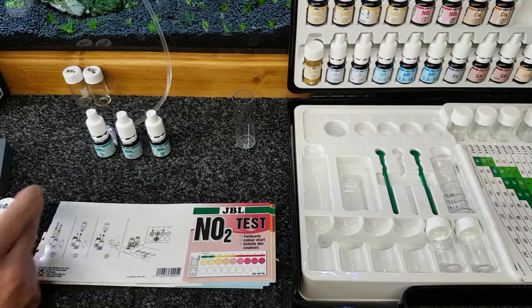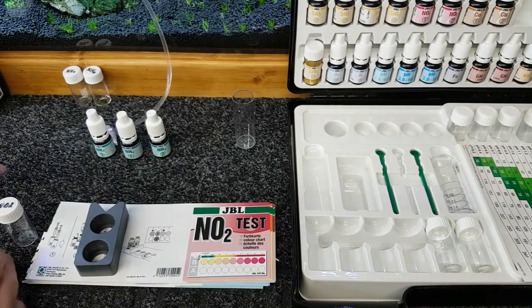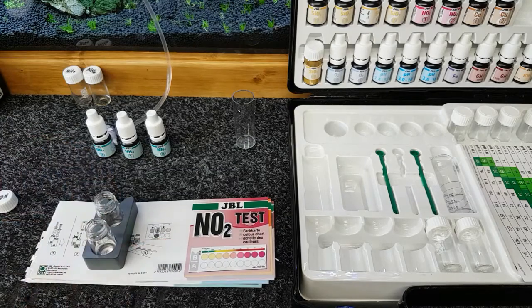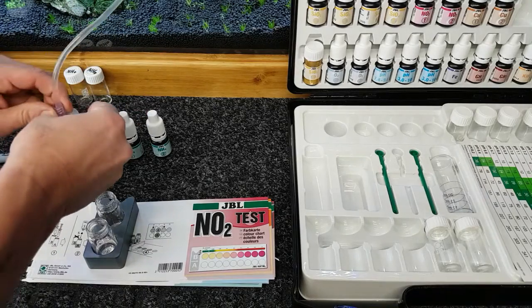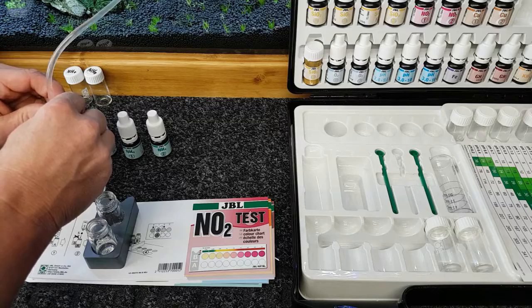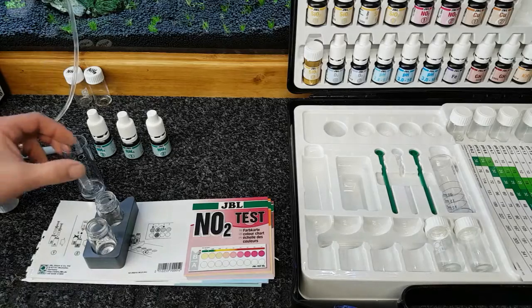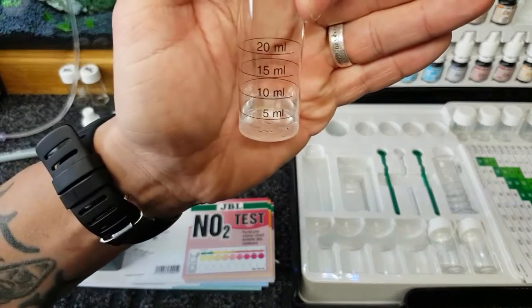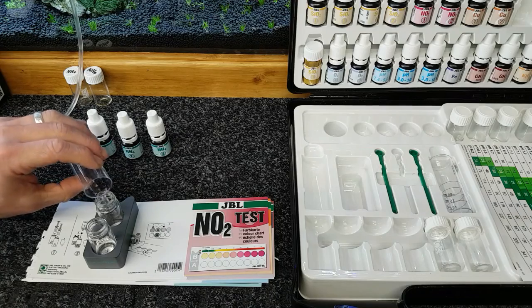And NO2 on there. So now we know that one is for nitrite. So same again, take the lids off, pop your vials into your little block there, grab this one again and drip in 5 ml of water into there. You see, there you go, there's your increments up the side there, and then you just pour that into there like we did before.